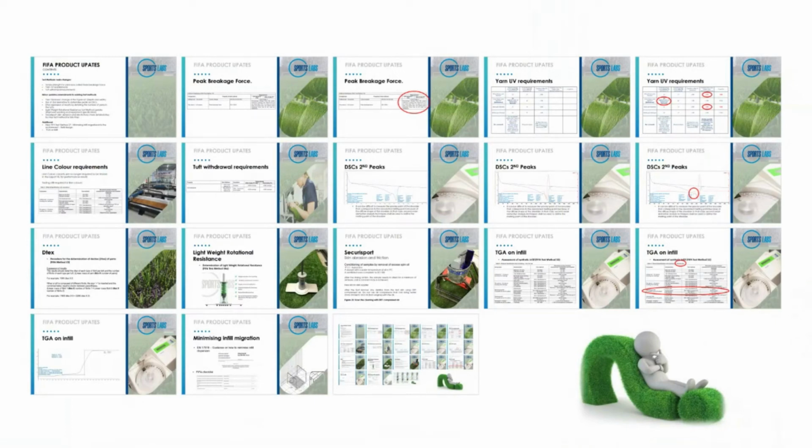Okay, thank you for that, Sean. The next question is a double barrel one, maybe from the same person, Simon and Oz. What size of sample for UVA is needed, and what size of sample is needed for DSC?